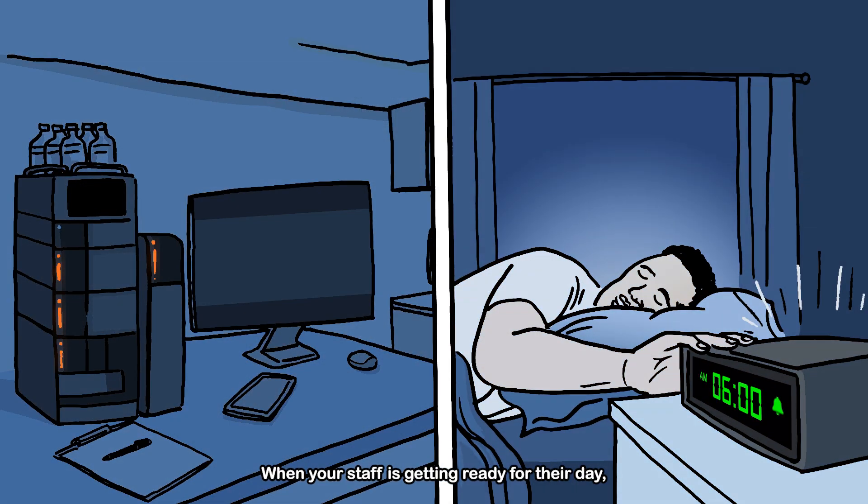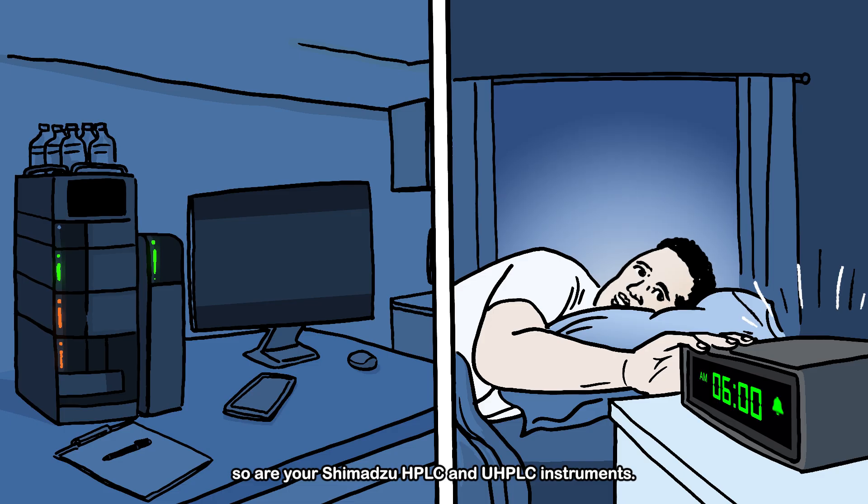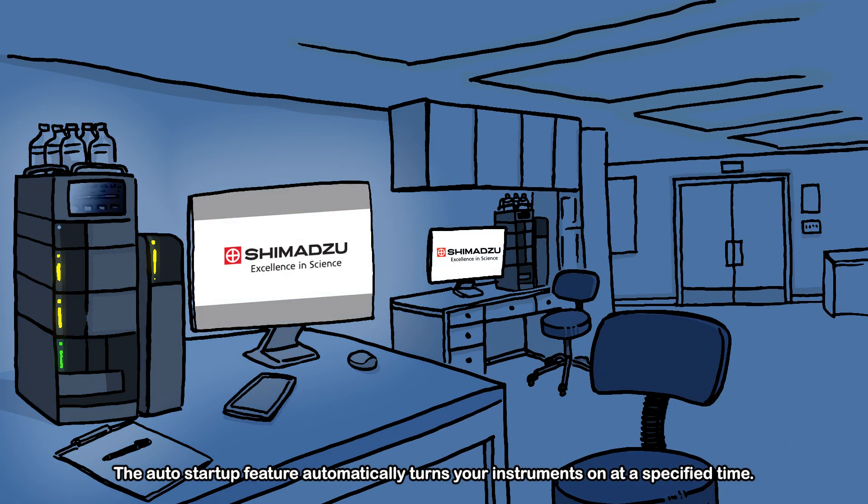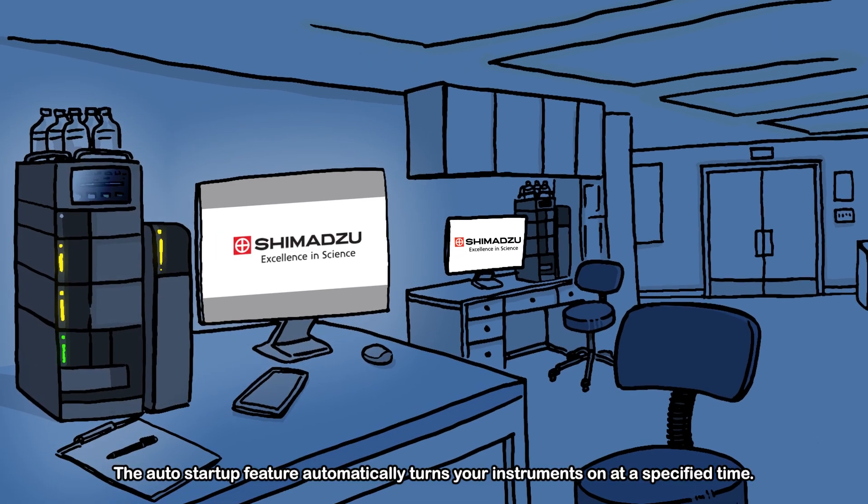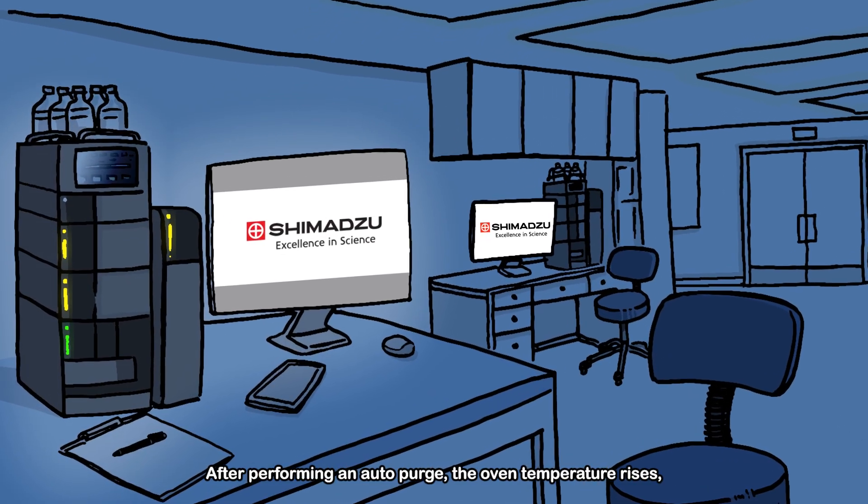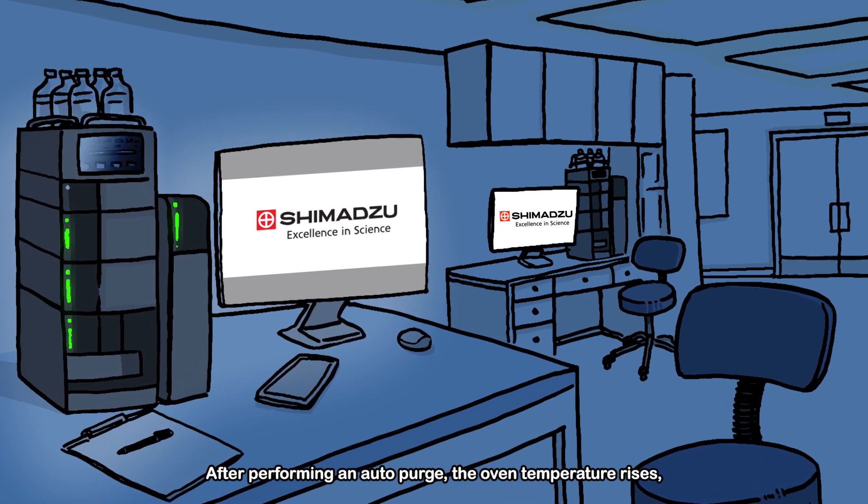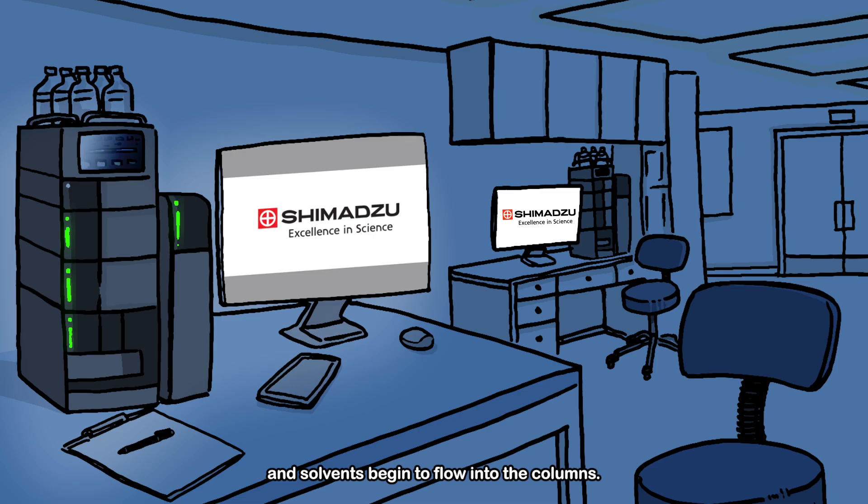When your staff is getting ready for their day, so are your Shimadzu HPLC and UHPLC instruments. The auto startup feature automatically turns your instruments on at a specified time. After performing an auto purge, the oven temperature rises and solvents begin to flow into the columns.